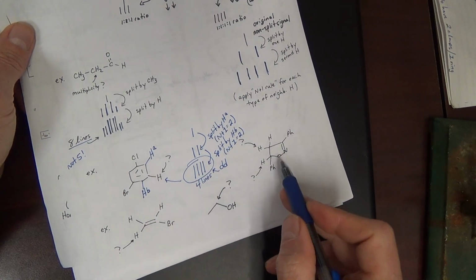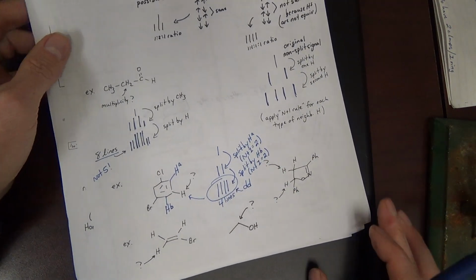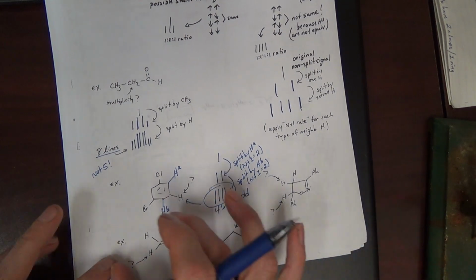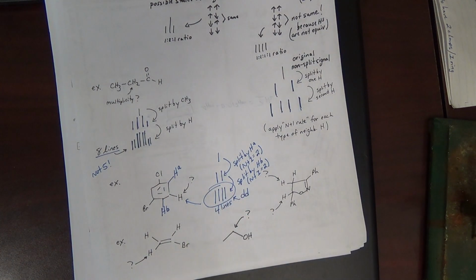You try these other 3 here. Don't write so much on your paper like I did, because you're going to have more to do and you want to have your own writing. Okay, I've mentioned that before. We just call this complex splitting. It's basically just splitting twice. I suppose you could have a compound where you needed to split 3 times, but that's going to be probably more rare, especially for us.